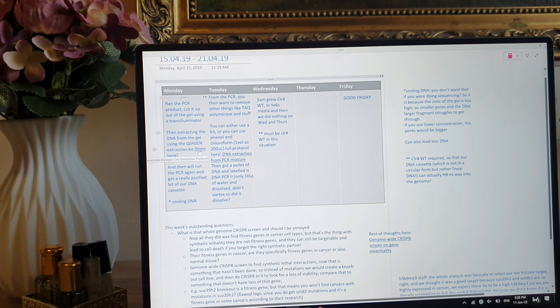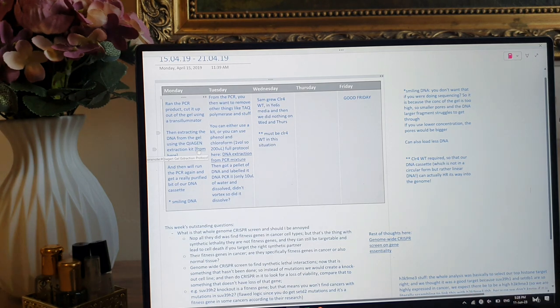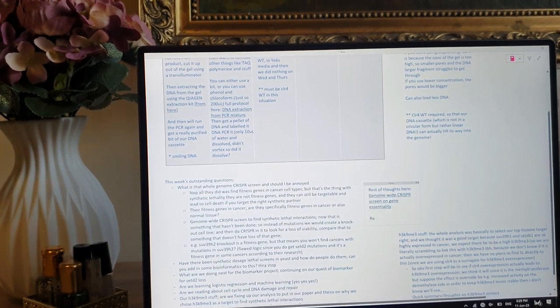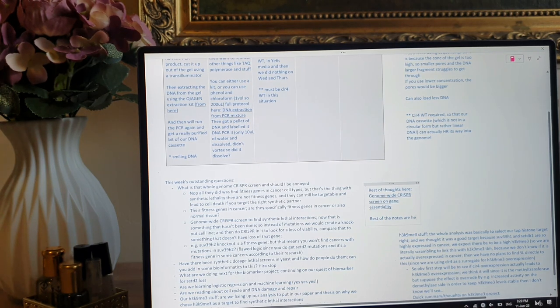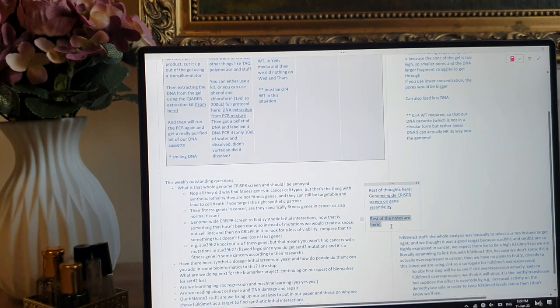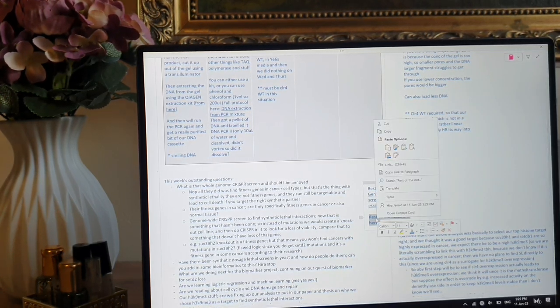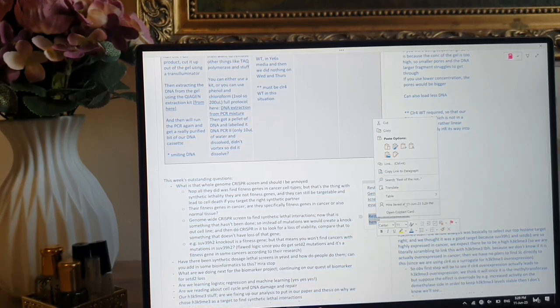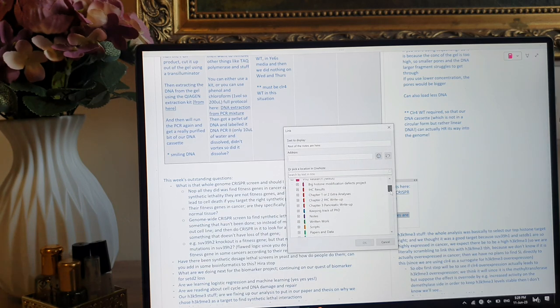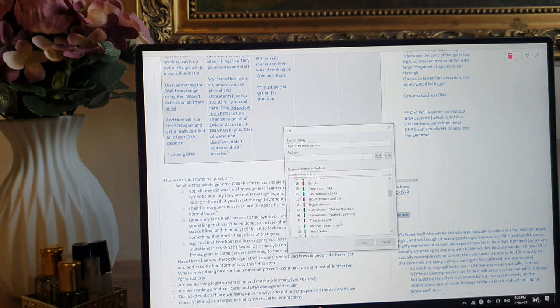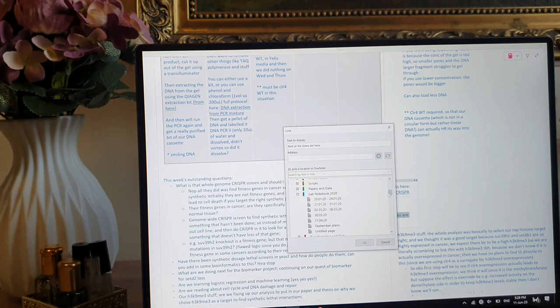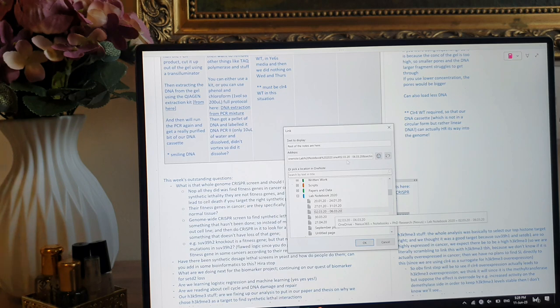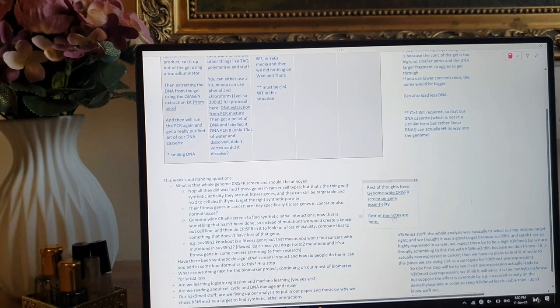Okay, so another feature is that you can actually link pages together and create clickable hyperlinks within OneNote. So that just blew my mind the first time I found out. So basically, you can just like write something and then create a hyperlink to a different page that is maybe related to that page. Or maybe it's a protocol on the side. You don't have the space to put in the whole protocol there. But you can just say, oh, check this page or check this protocol and write yourself a little note. Link it to the other page. And it can do that. And it can also do that to the files on your computer. But I just don't have the time in this video to show you everything. So you're just gonna have to explore guys.